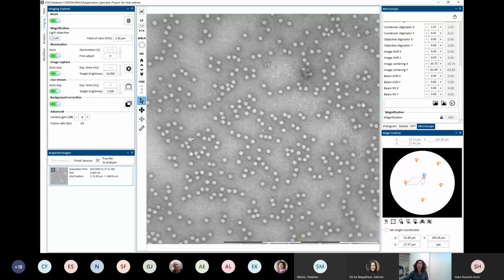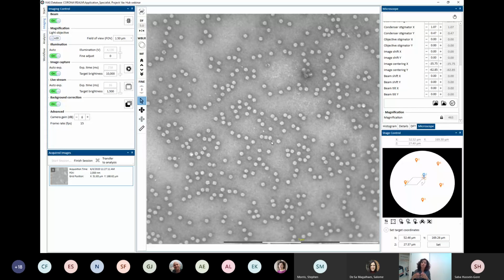You can do quite a lot of analysis on this, and I think in VaxHub and all the affiliates of VaxHub are doing some really exciting and great projects, working on fantastic and really fun particles. As a virologist, I love to look at and measure, and I hope that I've been able to convey that this can be used for other applications, not just AAV. And as Salome mentioned, we could possibly do a follow-up webinar where we can look at more specific cases. I see there is a question.